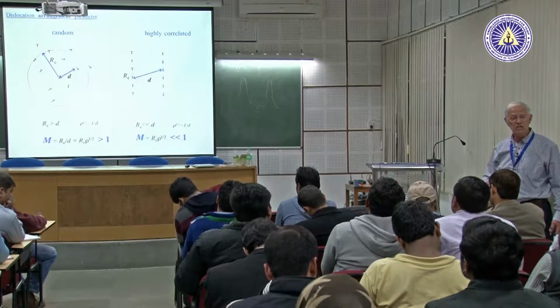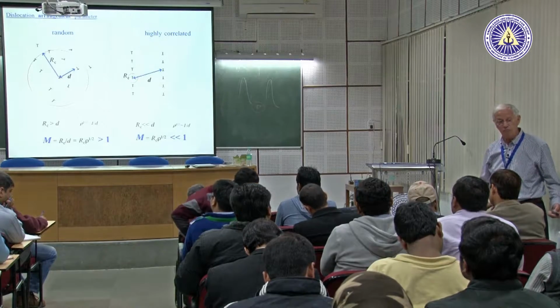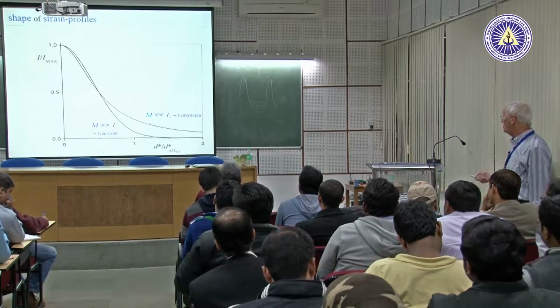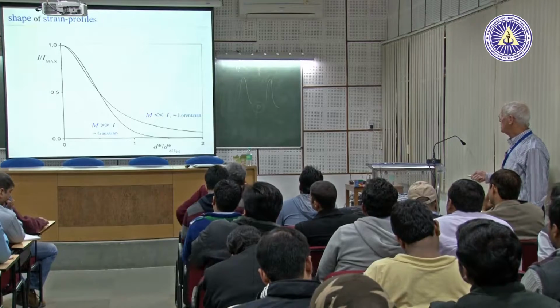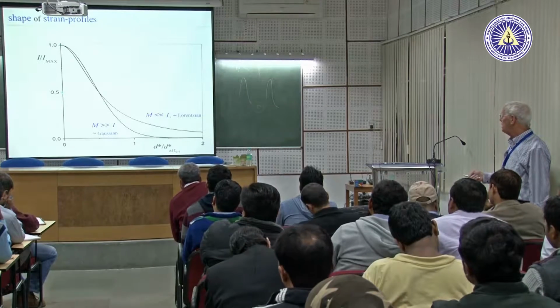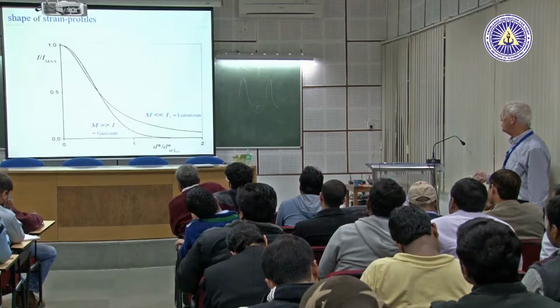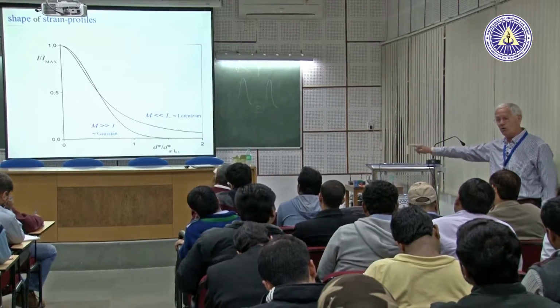So how can we see that in the diffraction peaks? Can we see that effect in the diffraction peaks? Well, theoretically, of course we can. When M is very small, then we have this long tail. These are two calculated peaks. The intensity is normalized to 1, and the breadth is normalized to 1, normalized together. And if this arrangement parameter is very small, that means strong screening, then the tail is long.